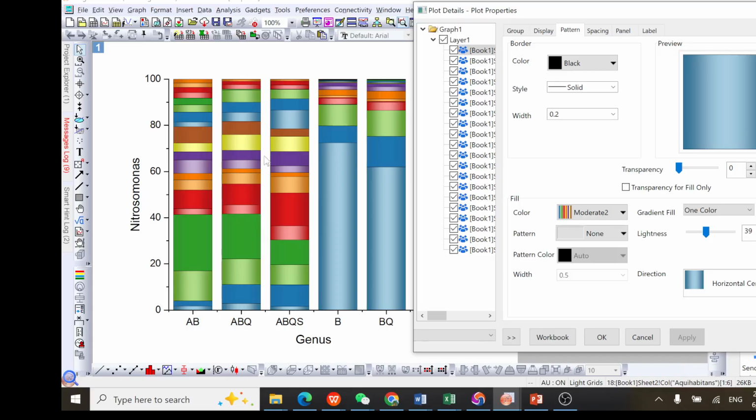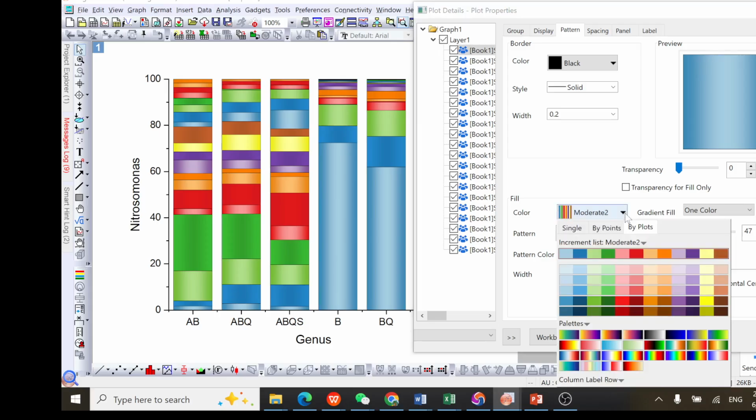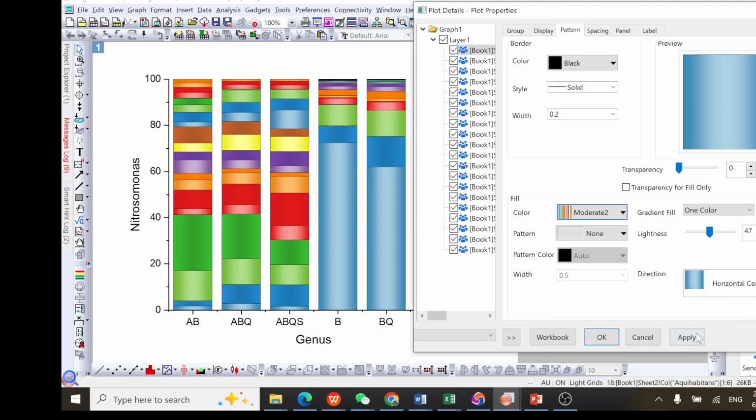But if you think maybe this color is not good to your taste, you can still change it. Or if you think you can modify, you can increase the brightness, the lightness. Or you can come to this place and choose which of the lightness you want. You can click on this one. If it is this one you want, then you apply. Let's change it. So let's go with this. Immediately you arrive at this place, then you close. You say okay, okay.